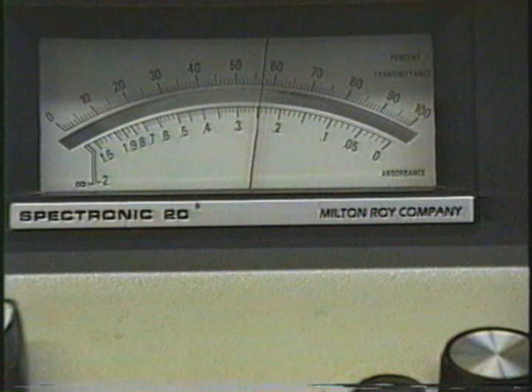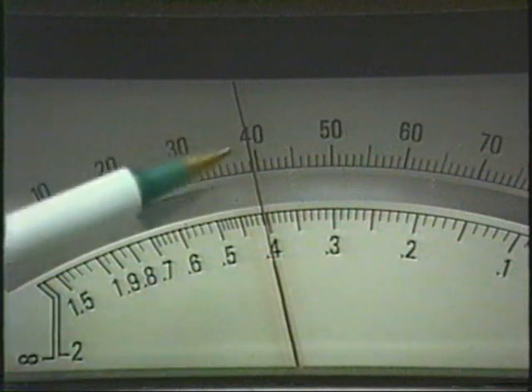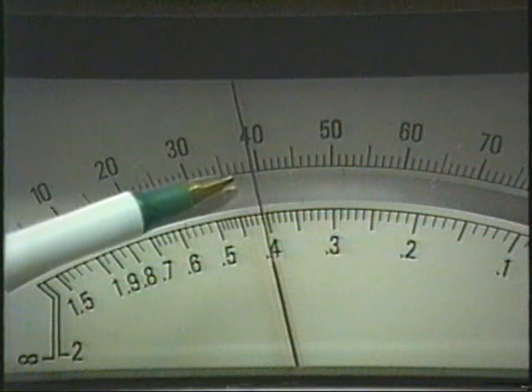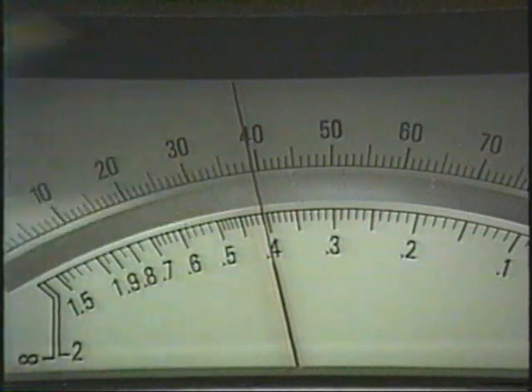Let's take a close-up at something called a parallax error. All right, here we have another sample in the spectrometer, and if we do the reading, we can see that it is reading 39.2 or 39.1% transmission. Now you see that you cannot see the reflection of the needle in the mirror here. You see there's a mirror, you can see the reflection of the pen, but you can't see the reflection of the needle. That means that you're looking directly on, and this is a correct reading.